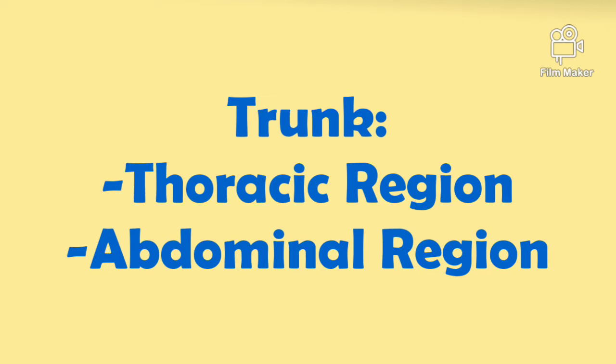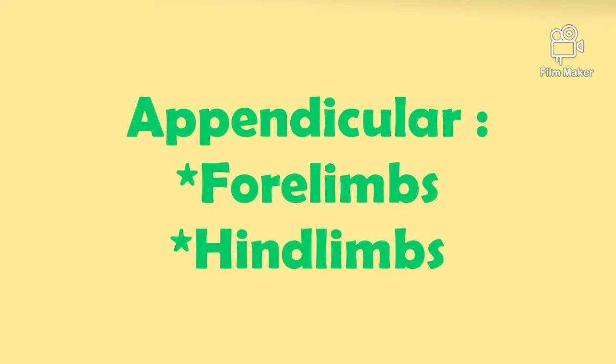The chest region is the anterior half of the toad. This is where you can find the poison or the outer mucus covering the toad itself, while the lumbar region is where the anus and the sacral hump, produced by the protrusion of the pelvic girdle, are found. Now let's move on from the axial region to the appendicular region.